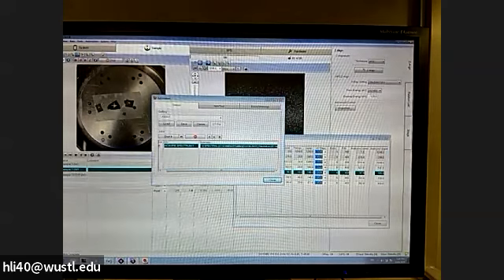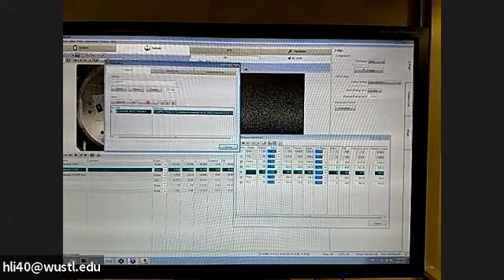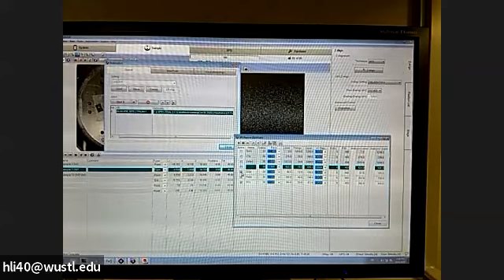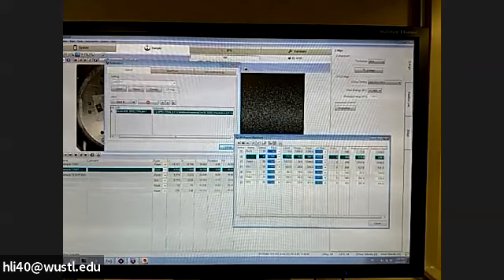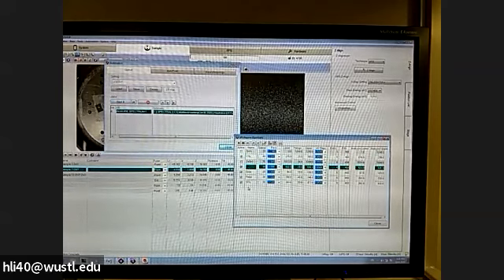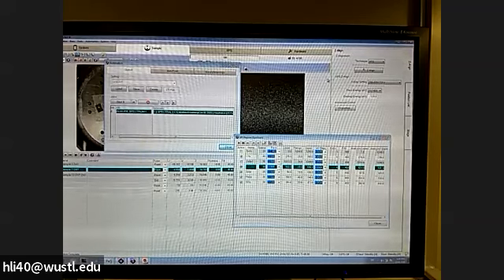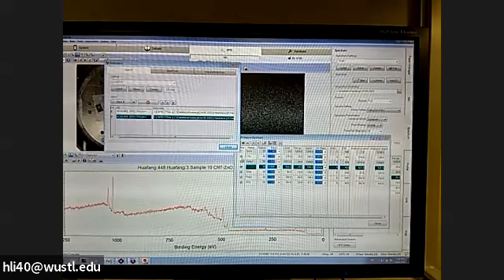Now we check sample two and set it up. It's carbon nanotube. So I'm going to turn zinc off. I need carbon, and maybe I put 40 switch there for the carbon. I add to the queue. Oxygen is still there because of silicon oxide. So I'm going to go back to here and say add to queue. For sample two, I'm interested in these elements.